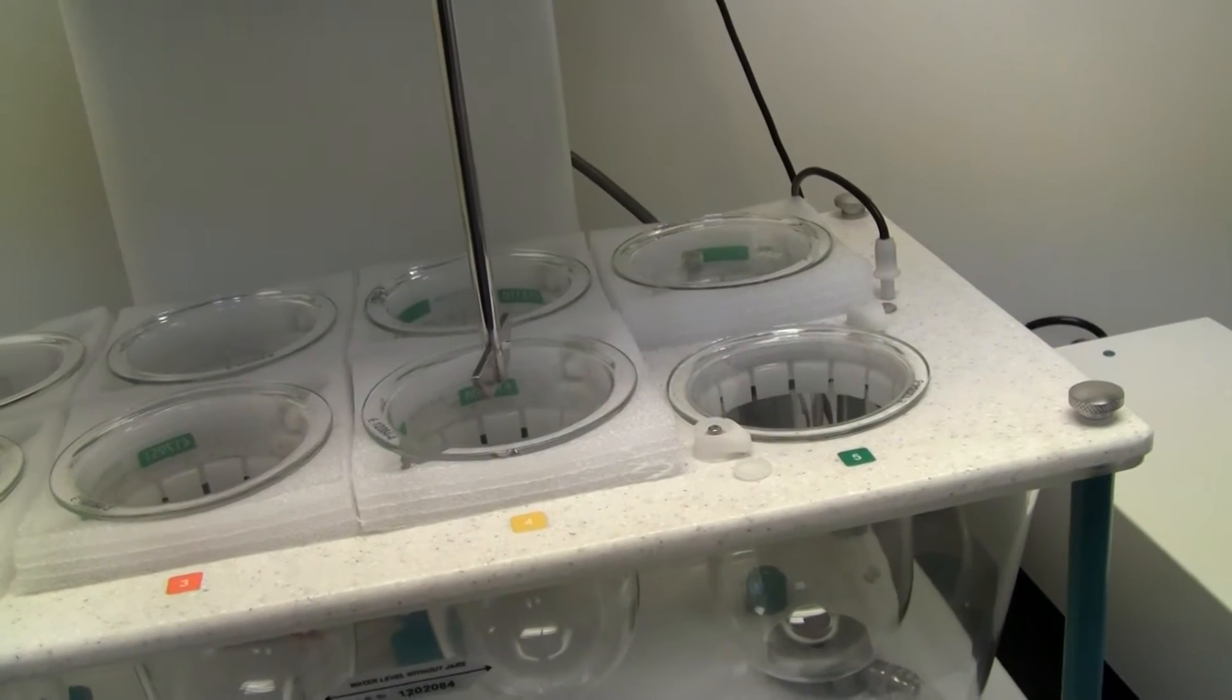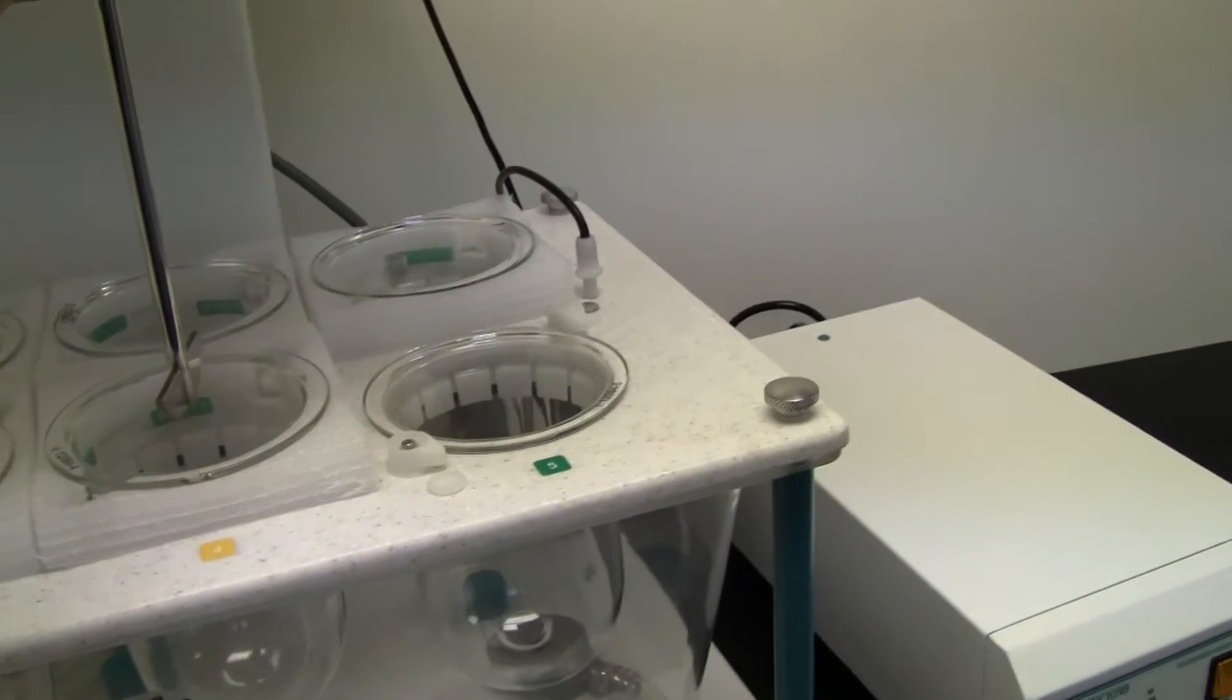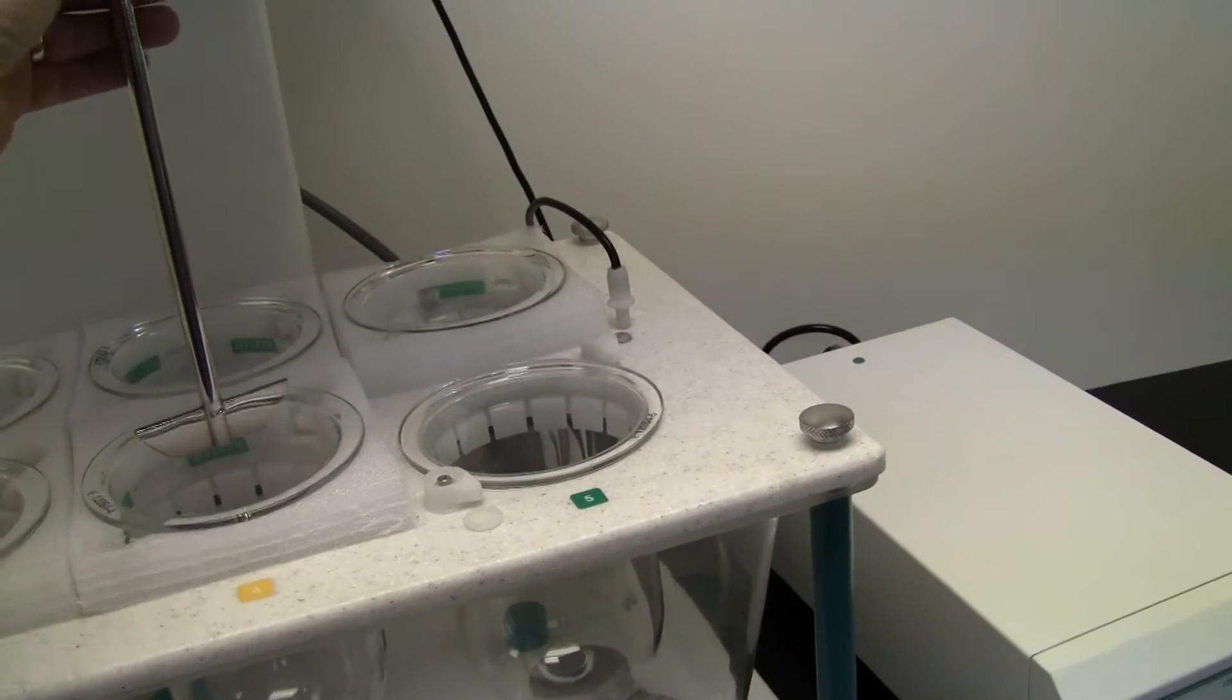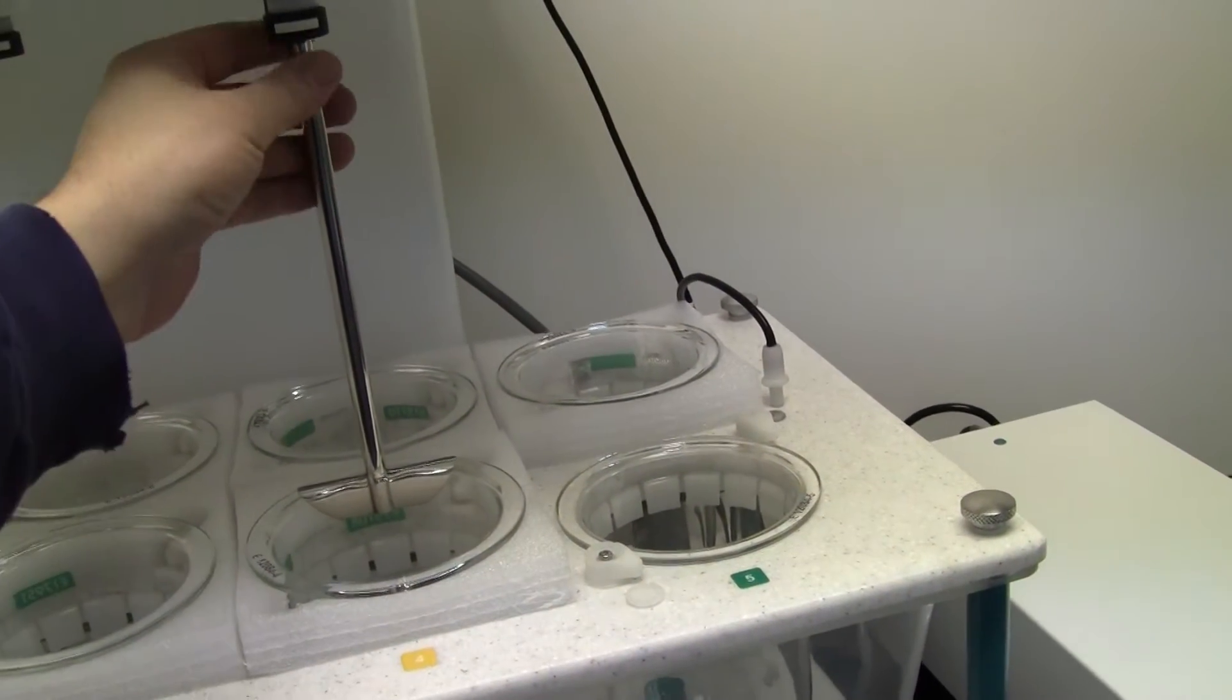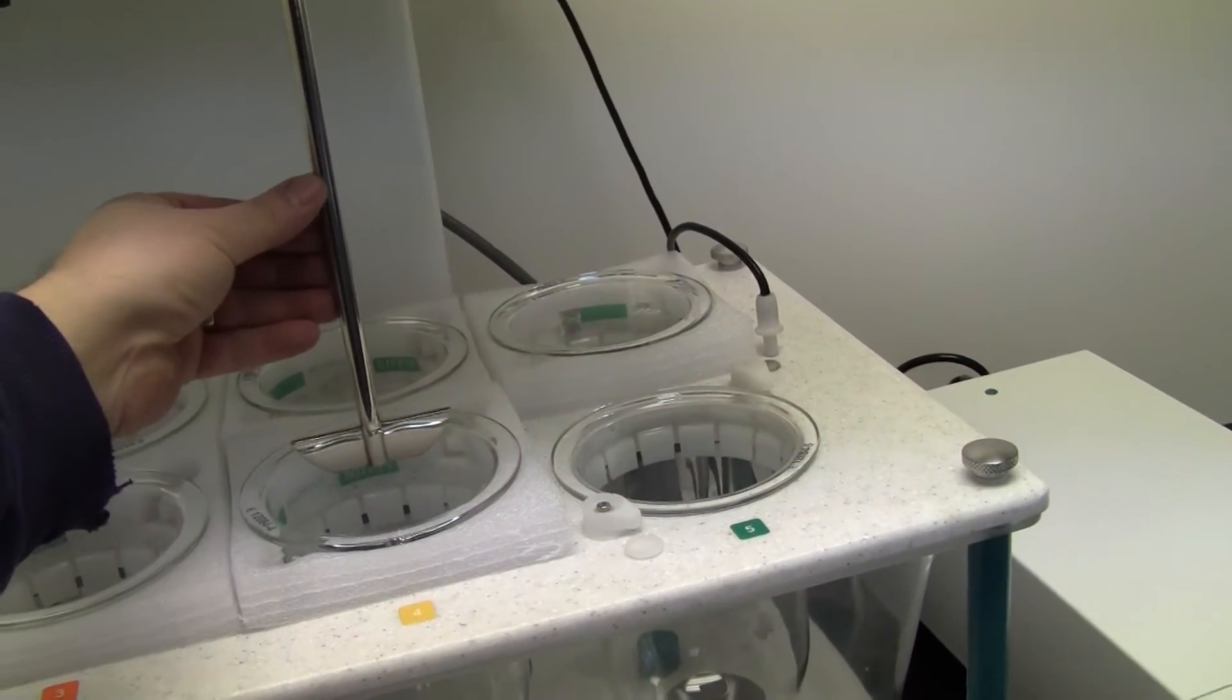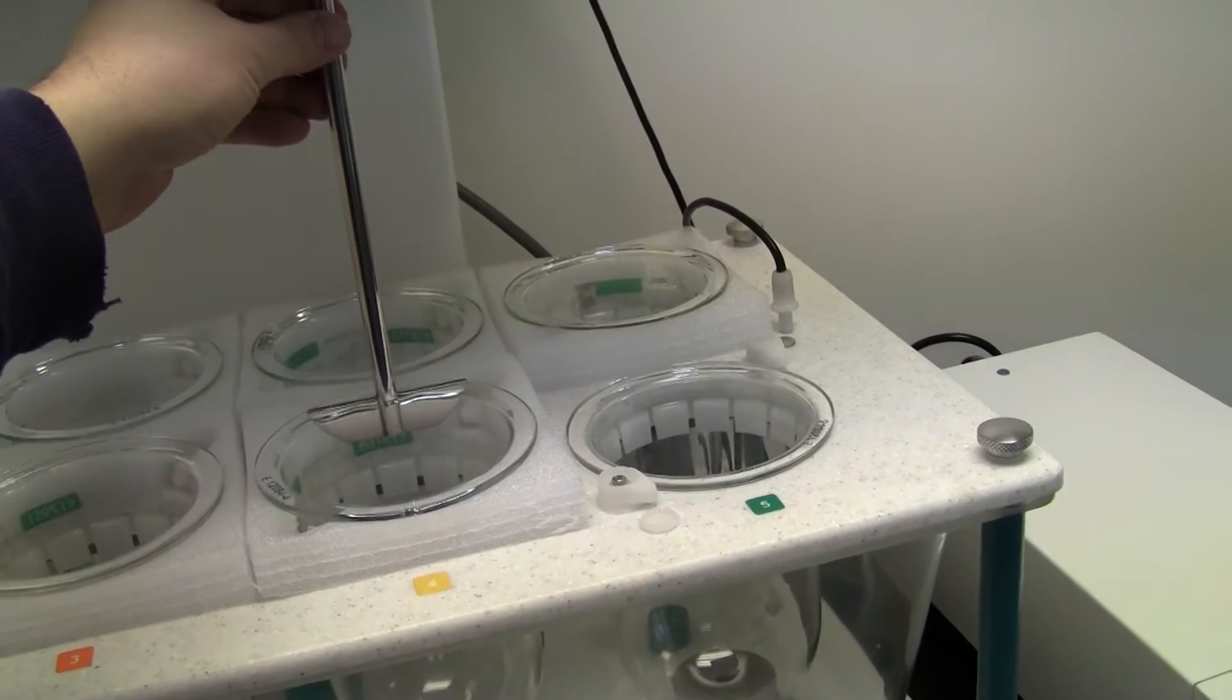I'd like to first point out what I like about the unit. It's got these snap, easy on, easy off brackets that you just hit the button and the paddle will just drop right down.